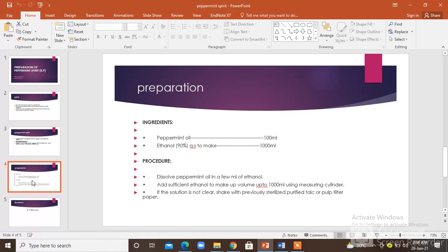Then add sufficient ethanol to make up the volume using a measuring cylinder. If the solution is not clear, shake it.